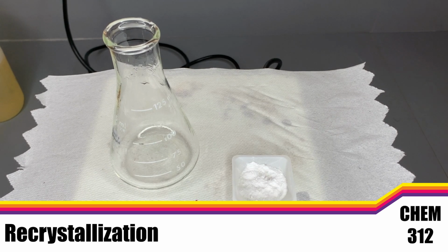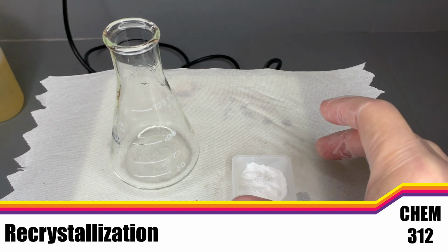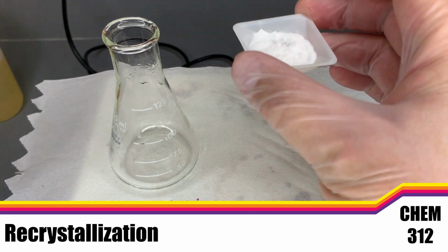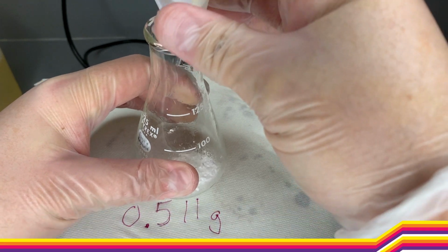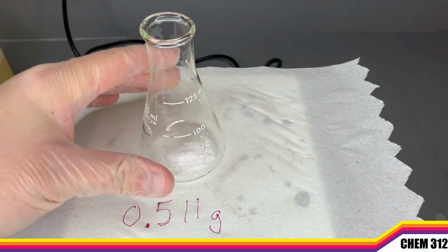So here we have our mixture of salicylic acid and caffeine. We have 511 milligrams, so 0.511 grams of this mixture. And I'm gonna go ahead and put this into our Erlenmeyer flask, and this is where we're going to be doing our recrystallization. And so there we have it right in there.